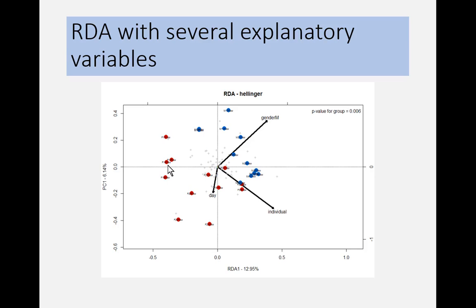Just thinking about the bacterial data, because there are extreme differences between the different columns, like in the abundance of species, would it be better to use some model-based multivariate analysis instead of the ordination approach? Yeah, you could. The basic problem with the ordination analysis typically is that you have many zeros in the matrix.